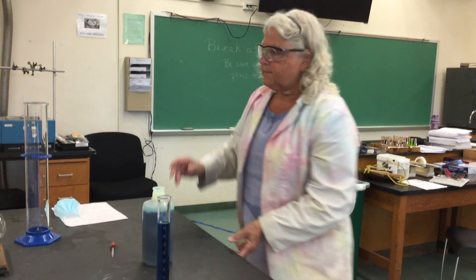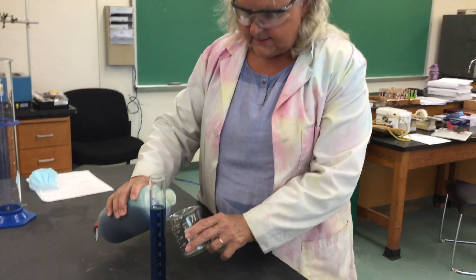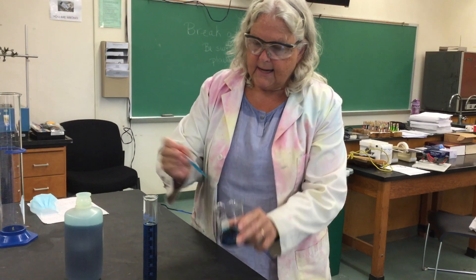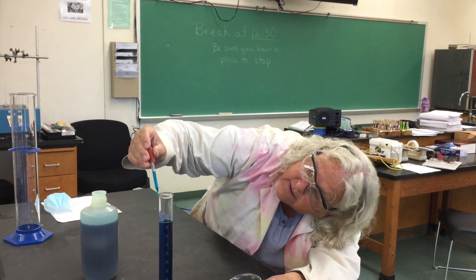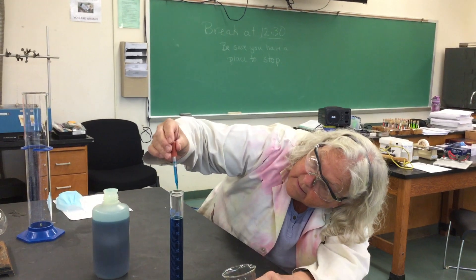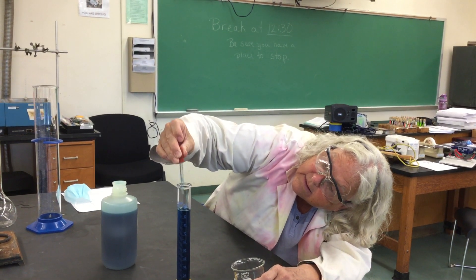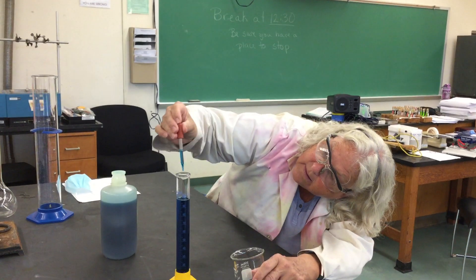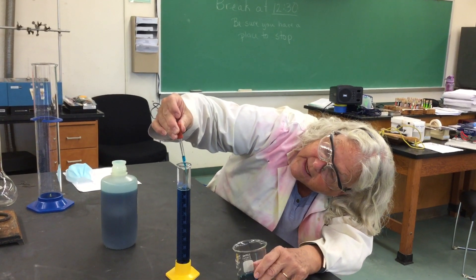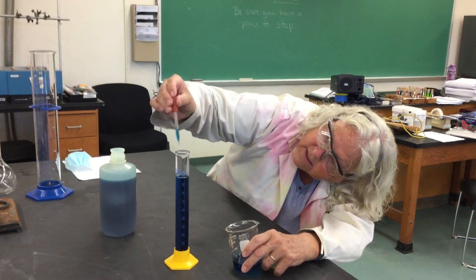To get it right to 100 milliliters, I can adjust the height using an eyedropper. I'll get some of my solution and add it carefully until the meniscus is sitting right on the 100-milliliter line. I don't want to overshoot it — I want it to be right on that line. Just a little more, and I want to be at eye level to see that the bottom of that meniscus is resting right on that line.